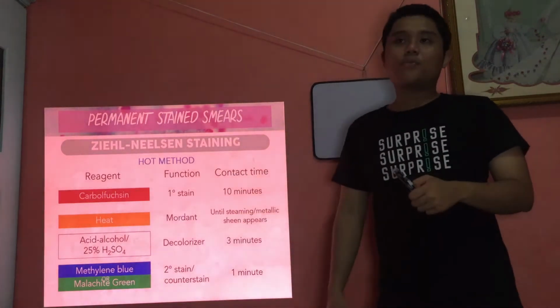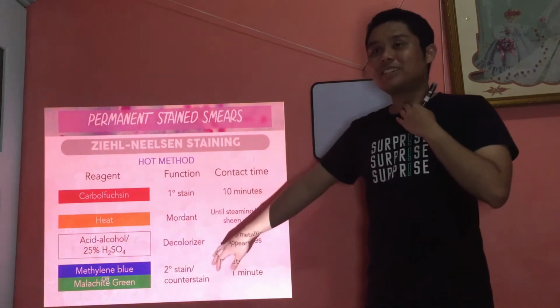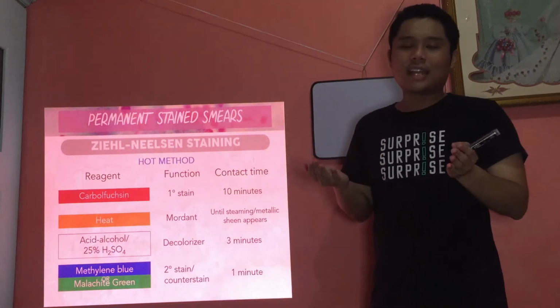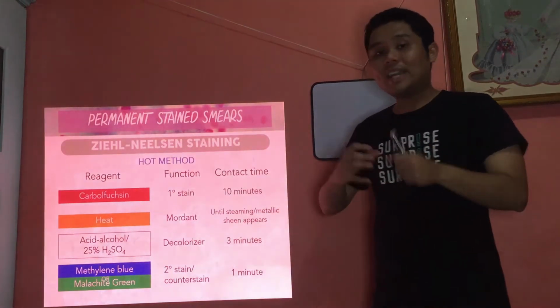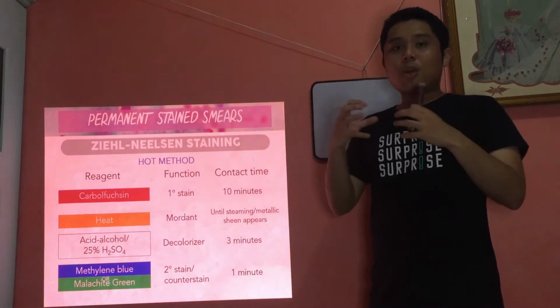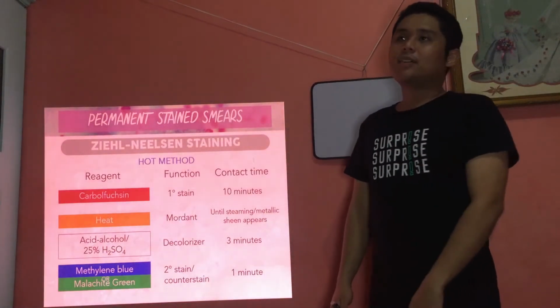Your mordant will serve as a reagent that will strengthen the relationship between the primary stain, which is carbolfuchsin in acid-fast staining, and your organism. For example, the long chain fatty acids or the structures that the carbolfuchsin is staining. So that's the purpose of the mordant. It strengthens the relationship between the primary stain and the organism that is stained.